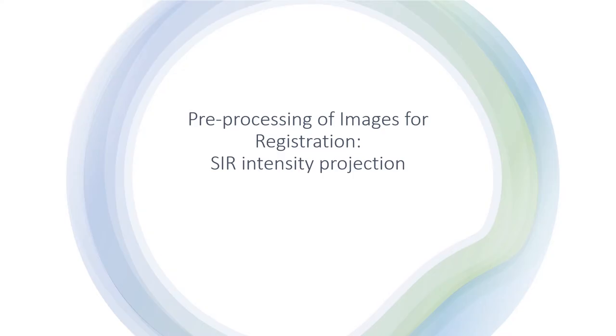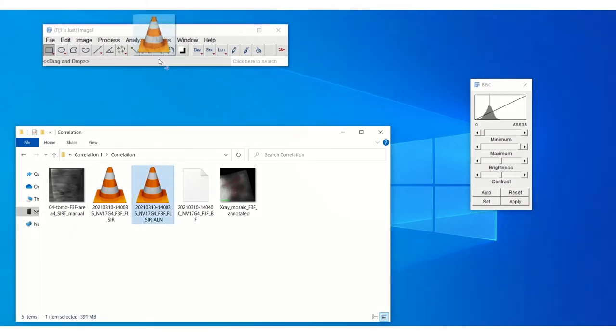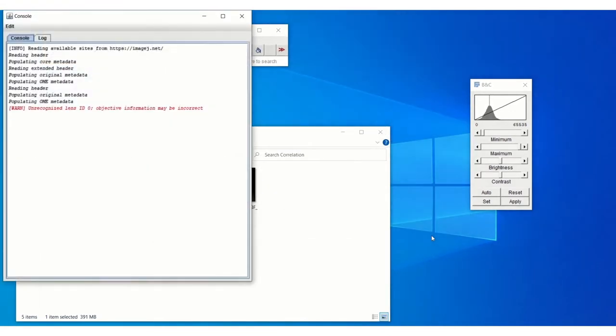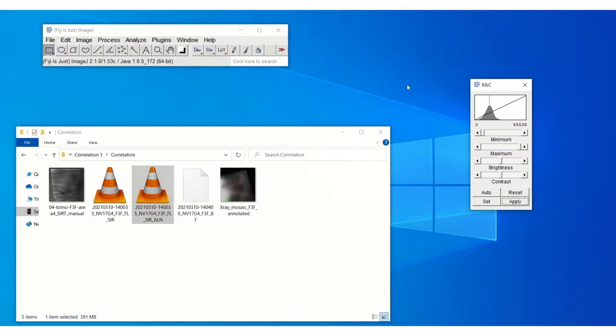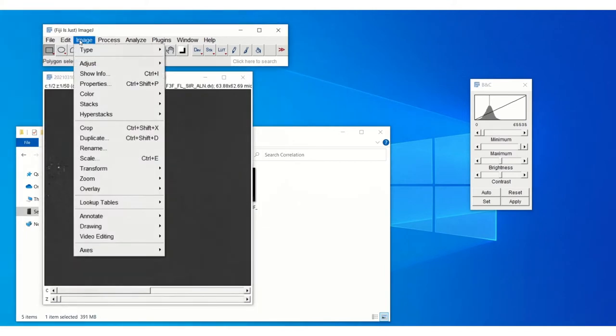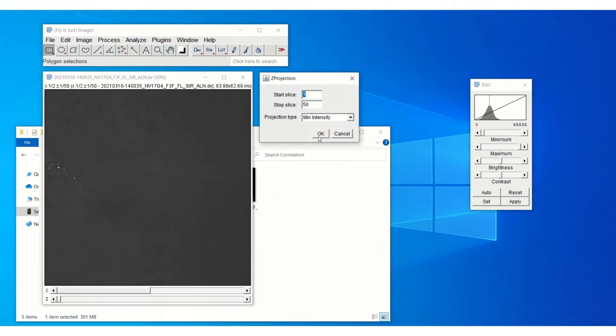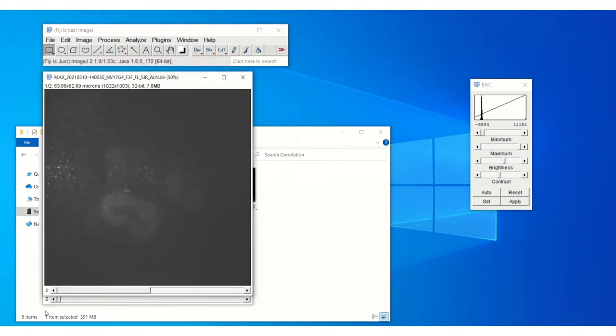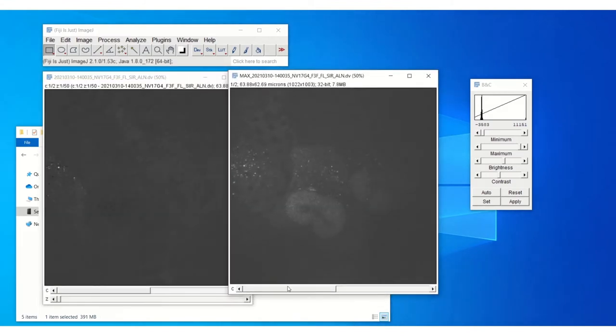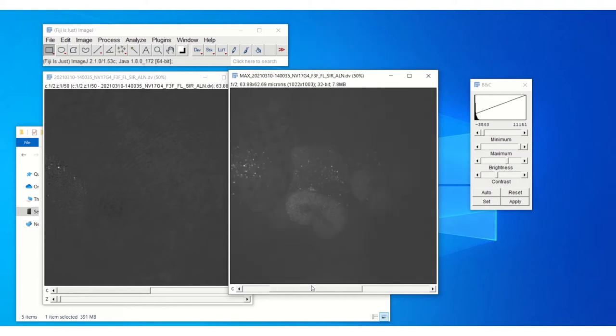And again we do that for the SIM image as well. So in this case we'll do a maximum intensity projection. You can save the image like this and that would work fine. Here I'm just changing the colours in the channels but that's not necessary. You can also do that when you open the image in IC.